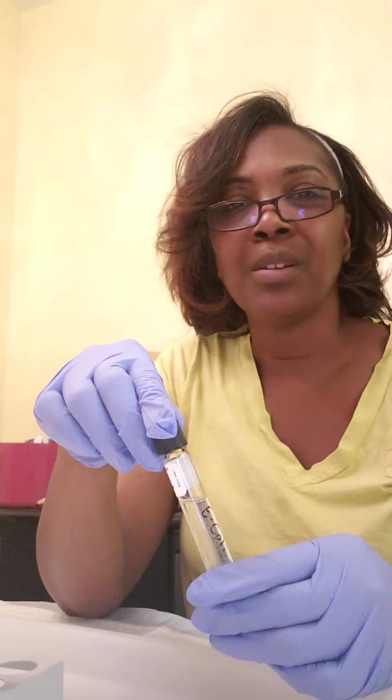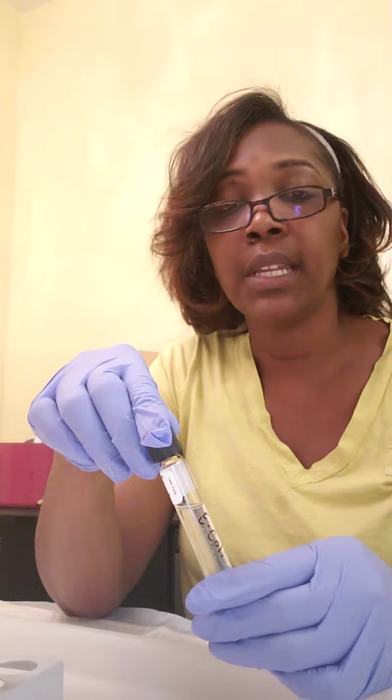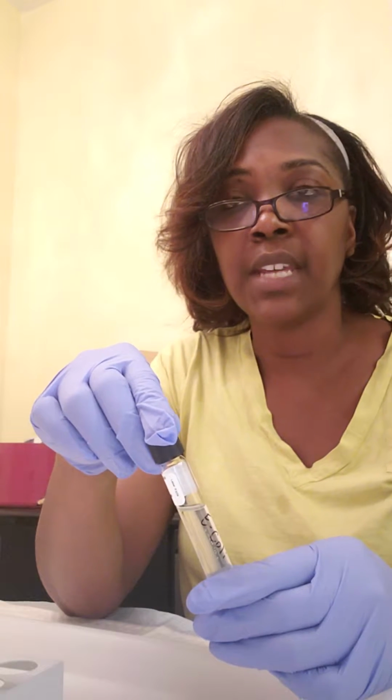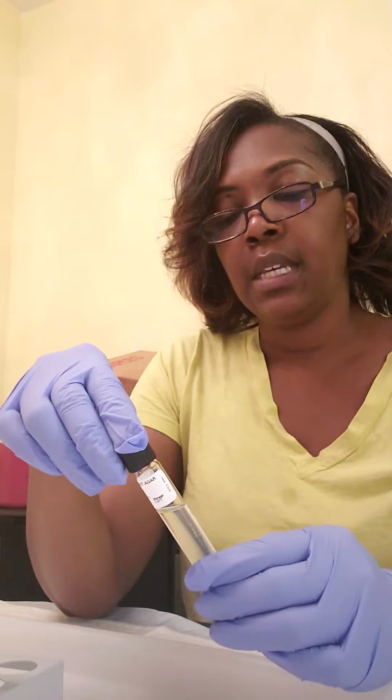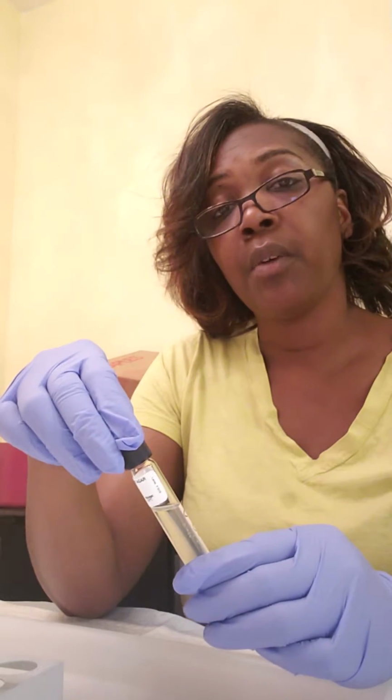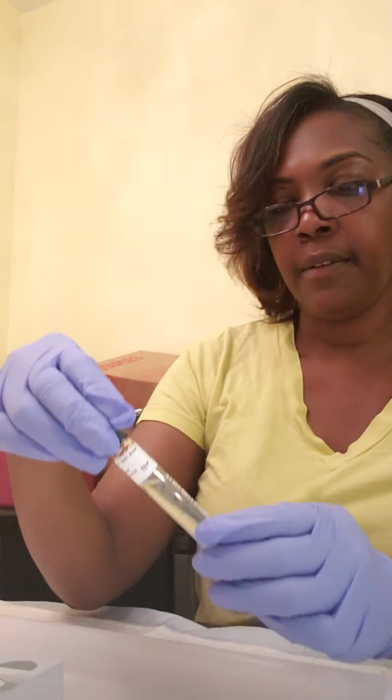At 48 hours, there wasn't too much growth, so I let it incubate for an additional day. So what we have here is the 72-hour growth. And the motility in this tube is negative.